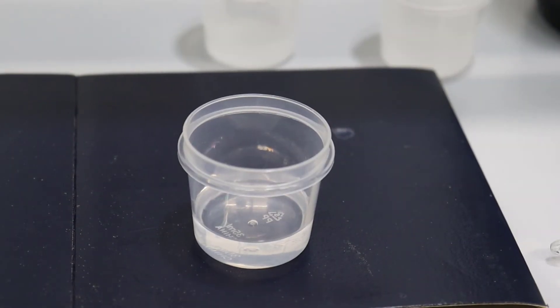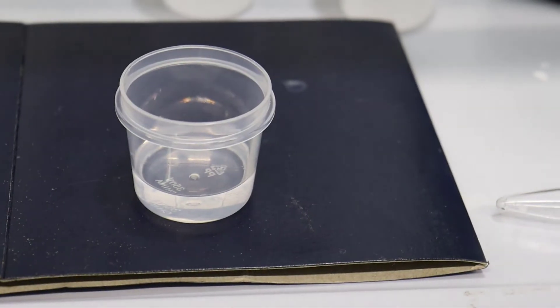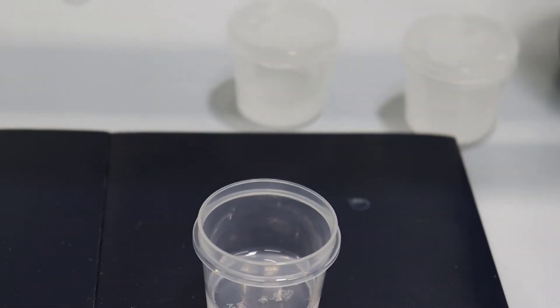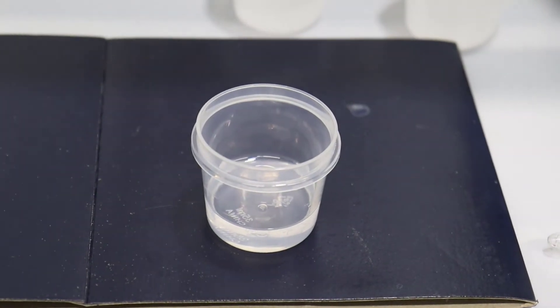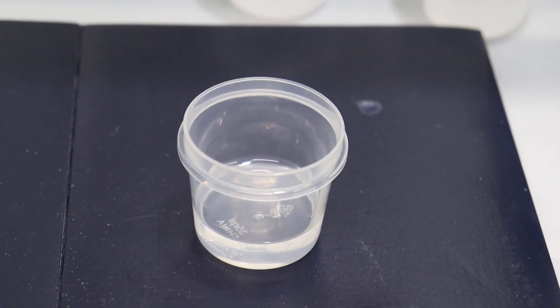Okay, an hour has passed and you can see that nothing obvious has happened. That's because the silane has hydrolyzed but it hasn't cross-linked very much, because the acid reaction doesn't cause it to grow very long parts of polymer. So what we're then going to do is add some base.